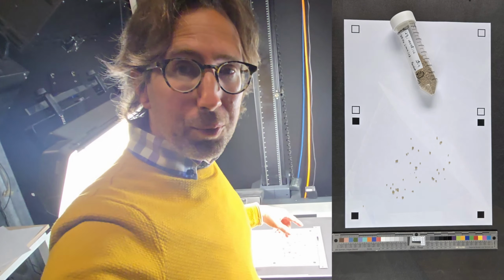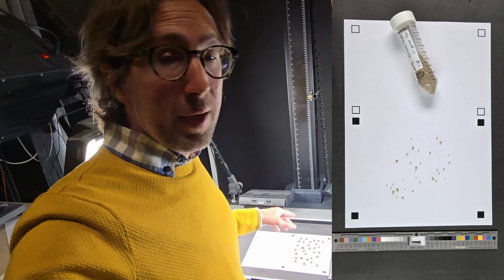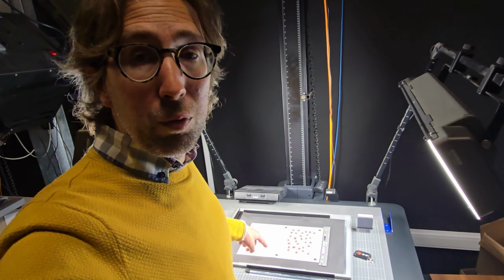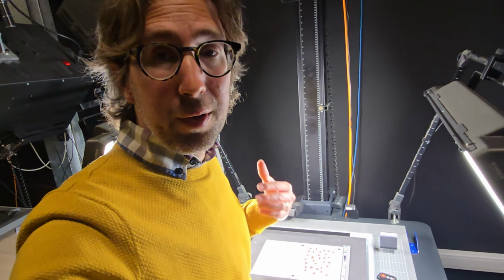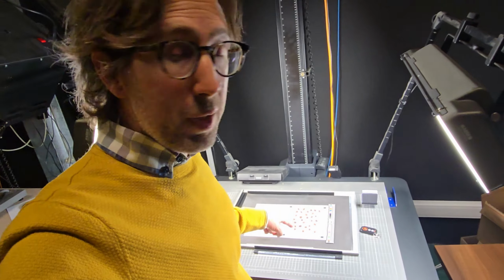So I developed together with Copilot and ChatGPT a script that, with just a cell phone image from this, would then take these 1 centimeter square reference points to have a sense for the distance, and then be able to calculate the size of each bean.